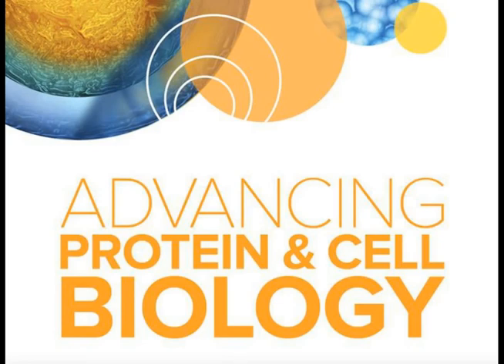And then something that's a little bit more robust, like the whole mitochondrial volume, if you have lots of Z-planes, that could take upwards of, not 3 minutes per plate, 3 hours per plate. The big one could take 30 hours. It's a big investment of time.